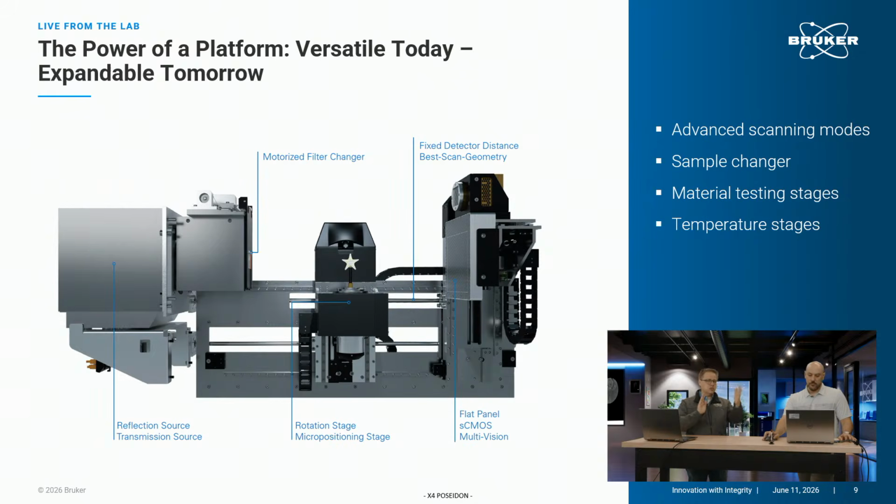We call that geometric magnification. Sometimes we abbreviate that GEM. Poseidon here, what we're seeing is something called GEM Plus. Right. So what's GEM Plus? How do we take geometric magnification to the new level?